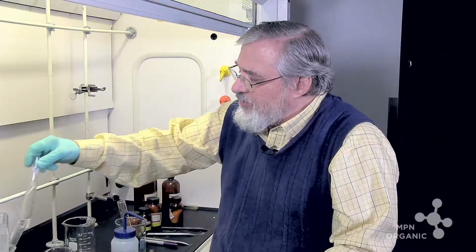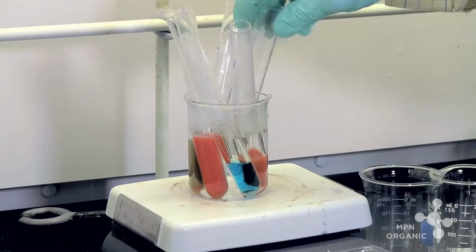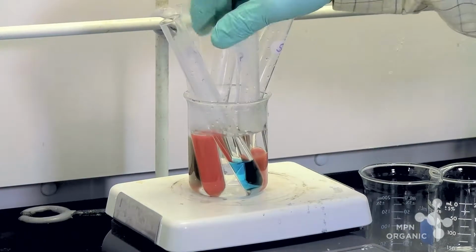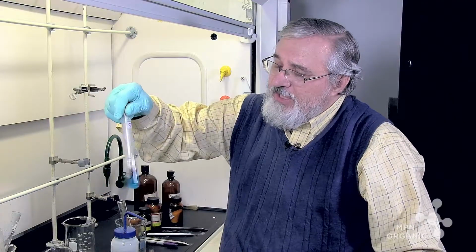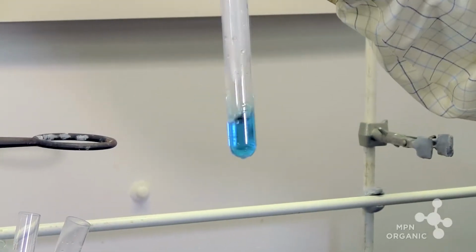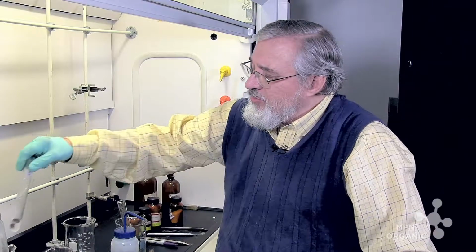And it will indeed catch up. Now, what I'm going to do, I'm going to heat up the sucrose that does not have any Benedict's in it. You can see the sucrose from the treatment with Benedict's is not changing color at all. And here we have sucrose.